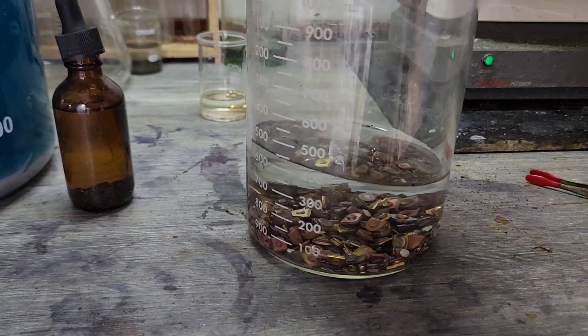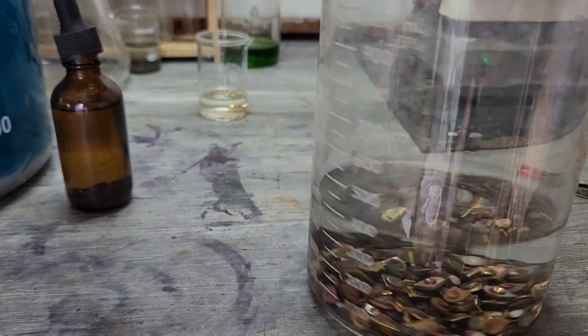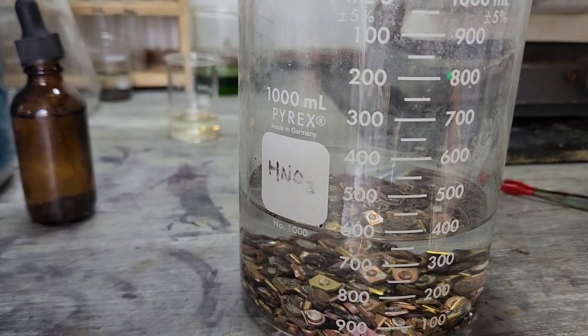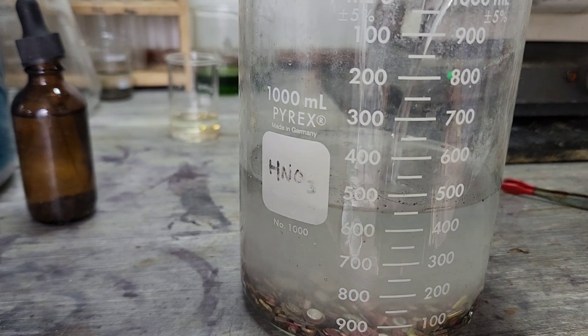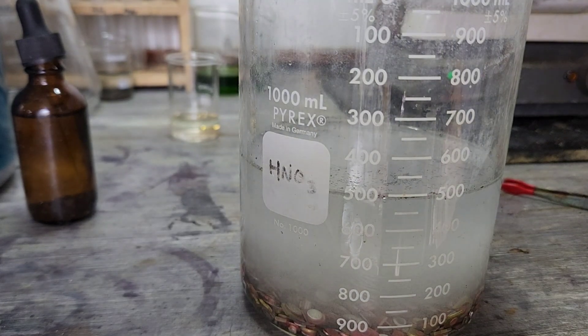I'm starting this experiment out with 400 milliliters of distilled water. We're going to go ahead and add some sulfuric acid. Here goes the sulfuric. There's 100 milliliters.